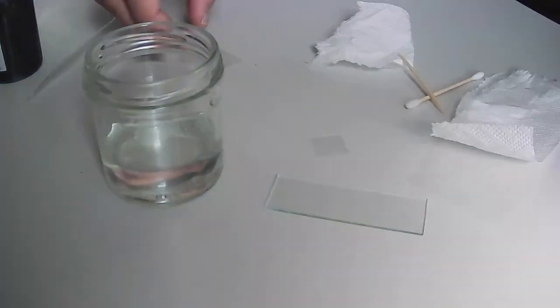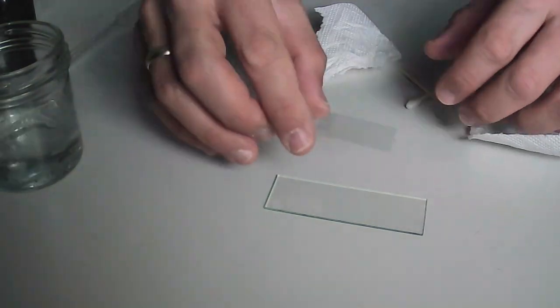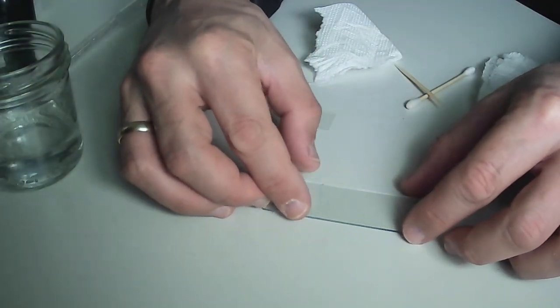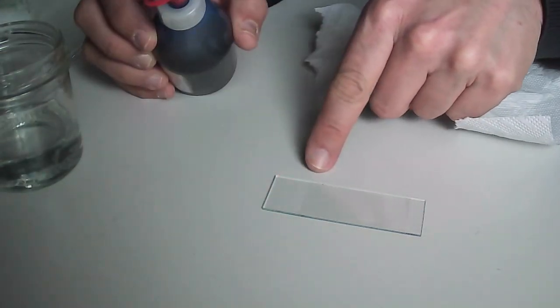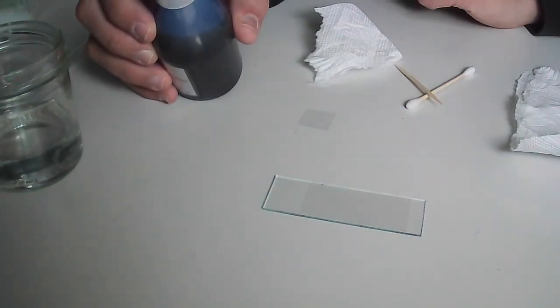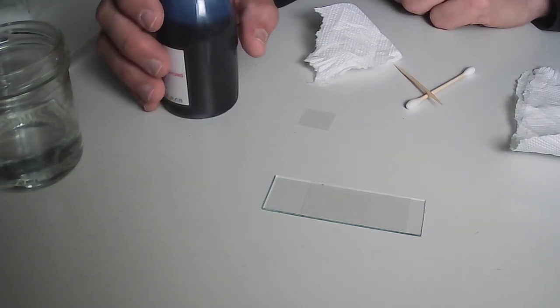Okay, so what I'll be doing now is I'm gonna be placing, there are different methods, yeah? But I'm gonna flip this down again here, okay? So what I'll be doing is without adding any water, I'm going to put this on top here. And then I'm going to apply some methylene blue here on the side, and it will be sucked in using capillary action. When doing stuff like this, you got to be careful, because you don't want to spill any of the stain on your microscope, of course.